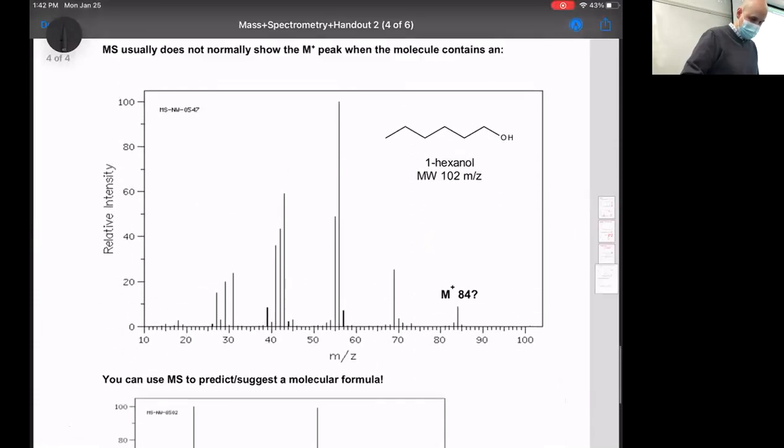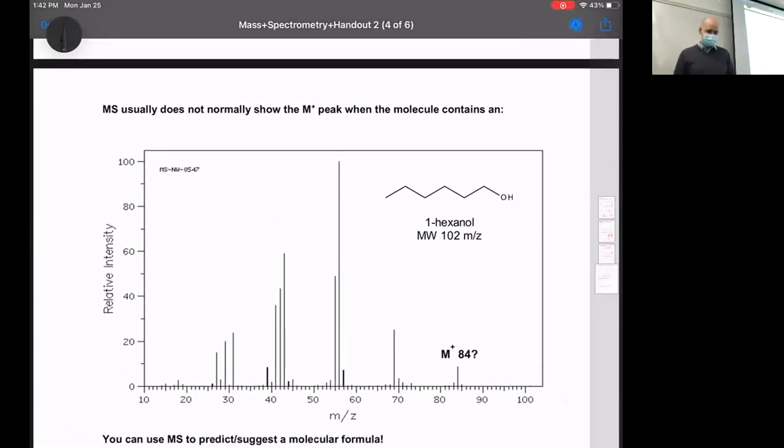All right. 2 more quick things for mass spec and then we're just gonna practice. You might remember on Friday, you might not, we had one major issue with IR, which was that if a bond was completely symmetrical, it didn't show up. So we saw that with an alkyne that was fully symmetrical, it just didn't show up. And basically IR lied to you and said, there's no alkyne here. The same thing happens with alcohols in mass spec.